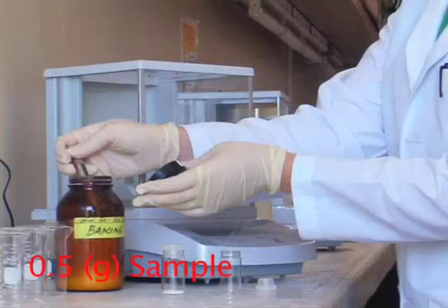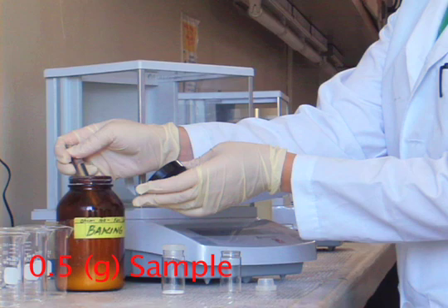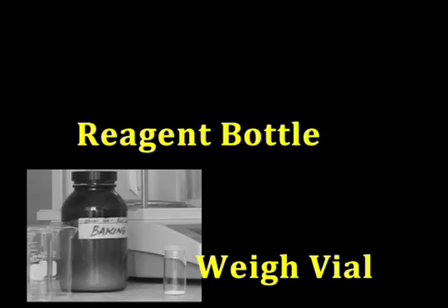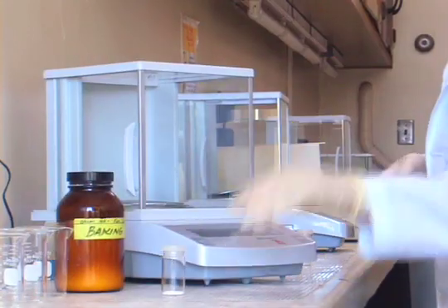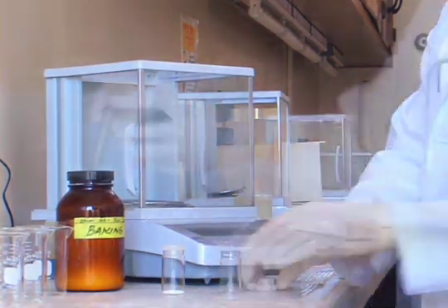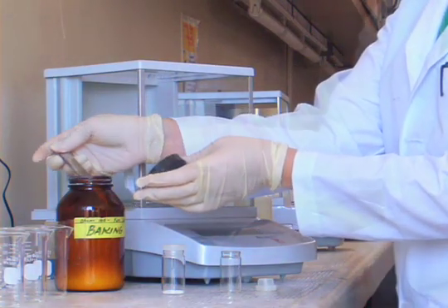Let's say that your experiment calls for two 0.5 gram samples of our solid, each in a 150 ml beaker. Using the sample weighing vial next to the reagent bottle as a guide, place a similar amount of solid onto your own weighing vial.